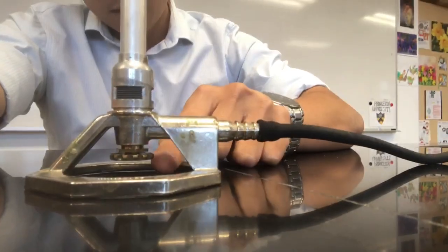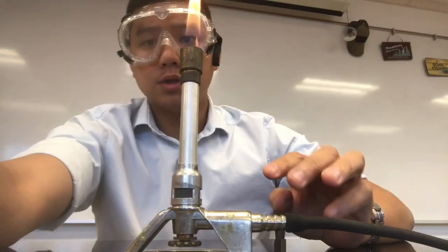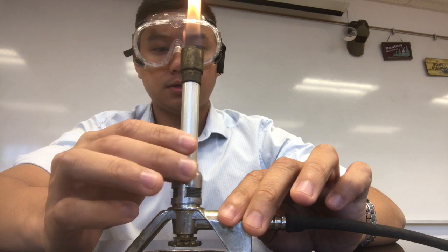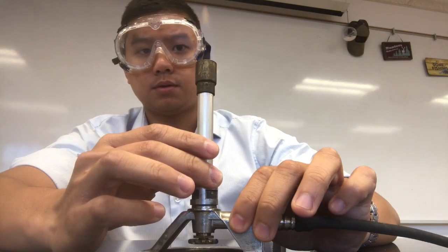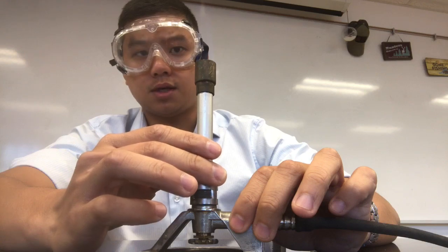Let's take a little closer look. This bottom one was that gas when I was controlling, and this one is the air. Right now it's orange. And when I let more air in, slowly turn it, more and more blue now. Okay, and you want to turn it until you have no more orange and get a nice tight blue cone. And there's that nice tight blue cone that you should see. There's still a little orange there, but there you go. Okay, and you should even, if you look closely, you should even see an outer blue cone and then an inner blue cone right here.